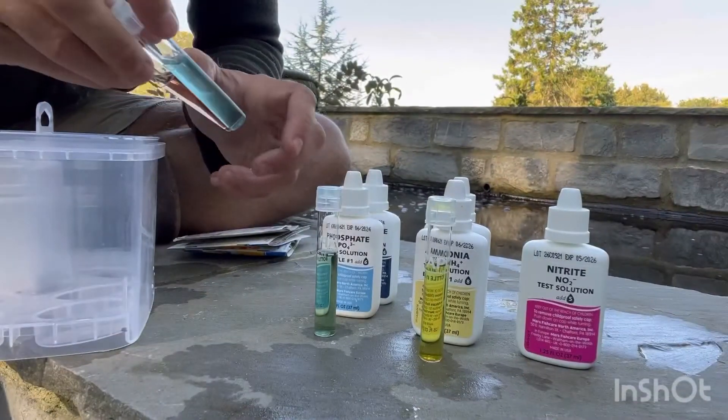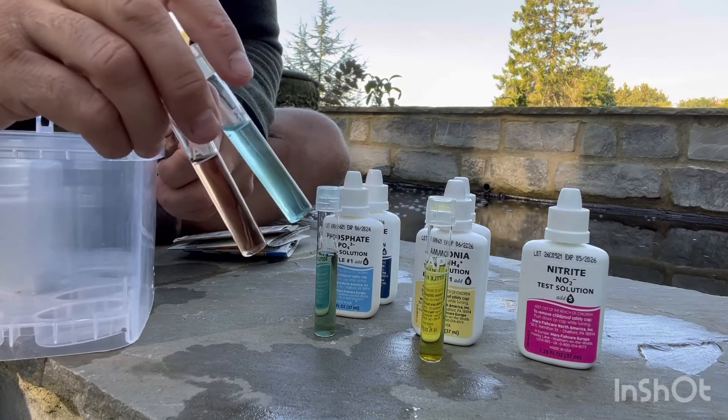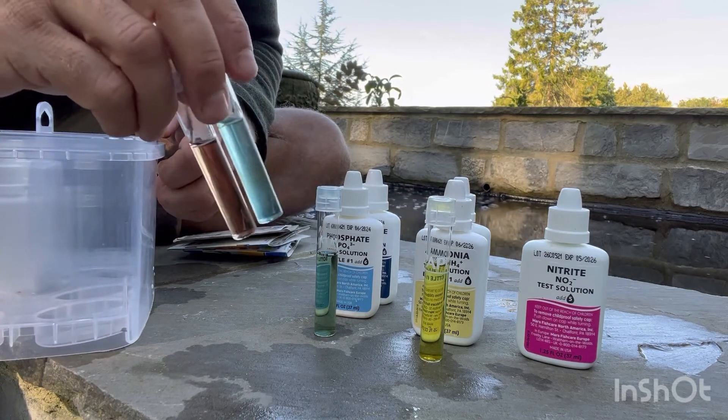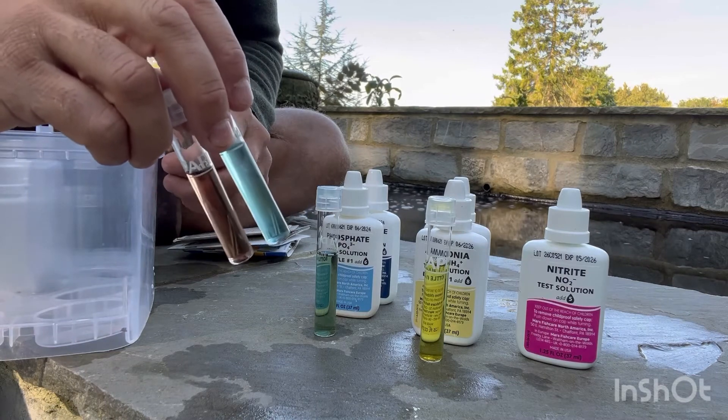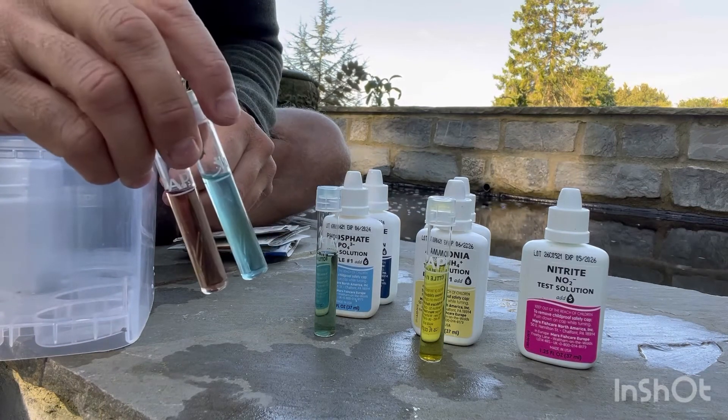One last piece of advice: as soon as you're done, clean your test tubes out. Don't leave them with the chemicals and water lying around in them because it can start to taint the glass. It doesn't make any sense — so as soon as you're done, clean them out well.